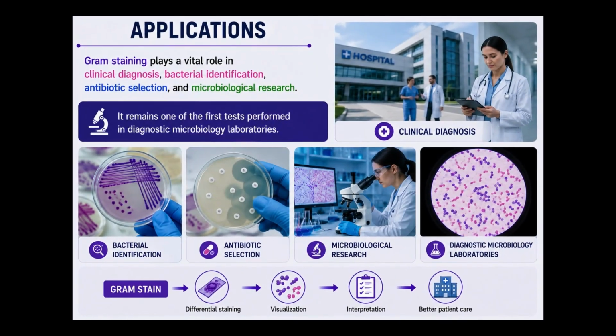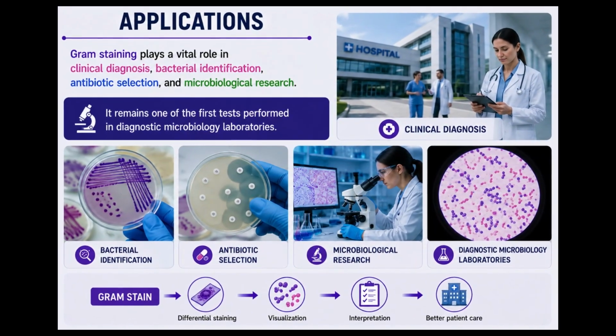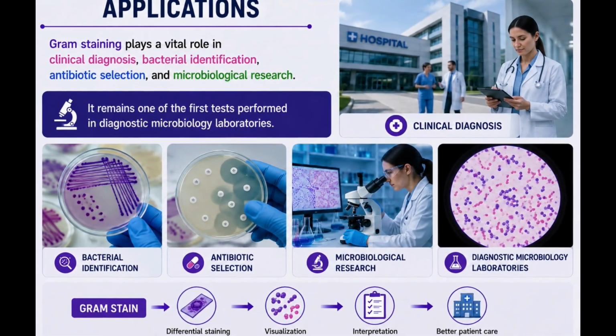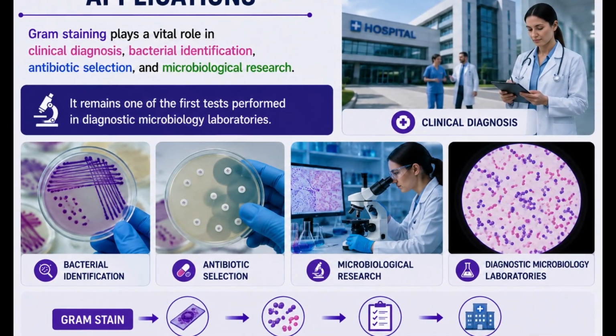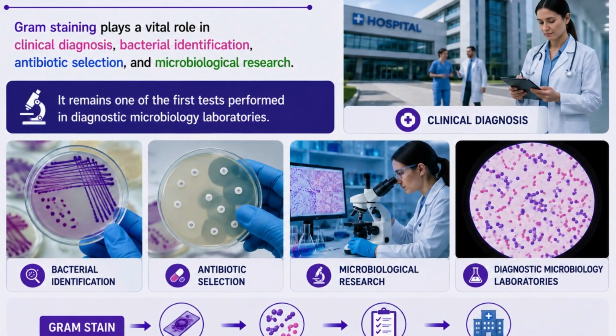Applications. Gram staining is one of the most important techniques used in microbiology laboratories. It helps in the rapid identification of bacteria. It assists physicians in selecting appropriate antibiotic therapy. It is widely used in hospitals, diagnostic laboratories, research institutions, and educational laboratories around the world.